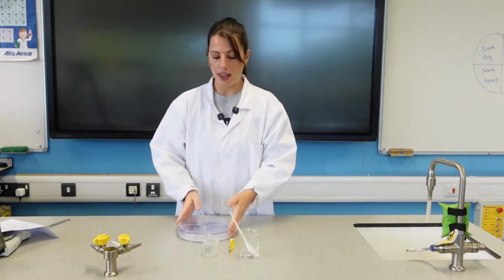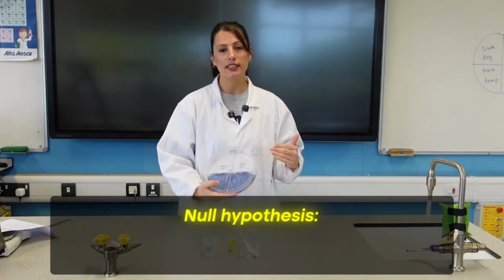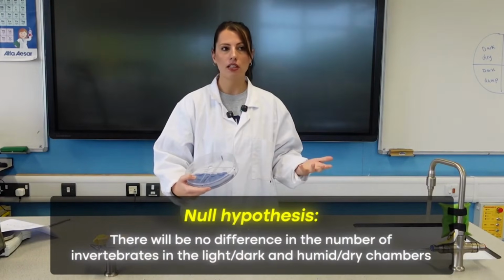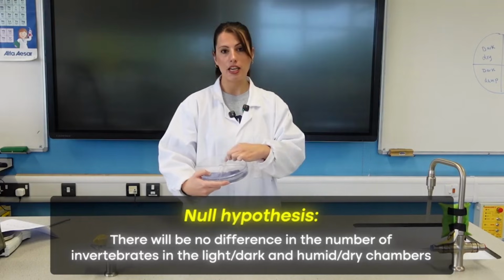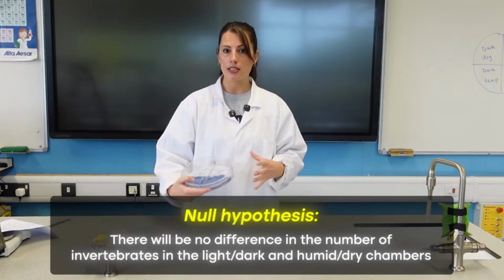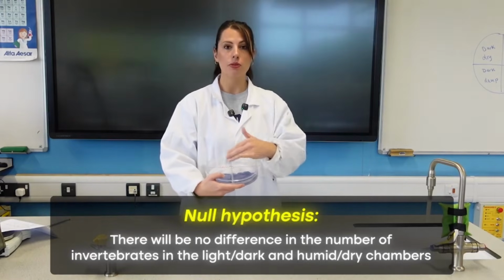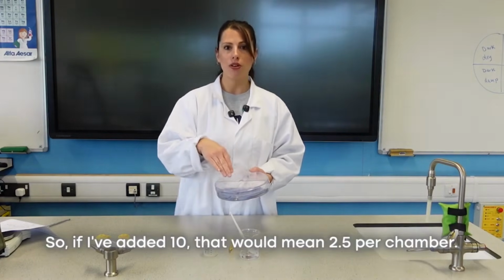But the key thing is here, we added 10 maggots. When it comes to the chi-squared statistic, our null hypothesis would be along the lines of there'll be no difference between the number of maggots that we expect in each chamber and the number of maggots we observe in each chamber. And when we say the number we expect, we'd be expecting an equal split for our null hypothesis. So if I've added 10, that would mean 2.5 per chamber.